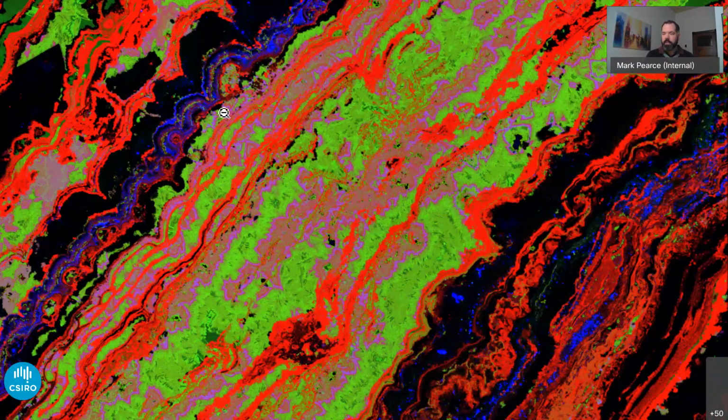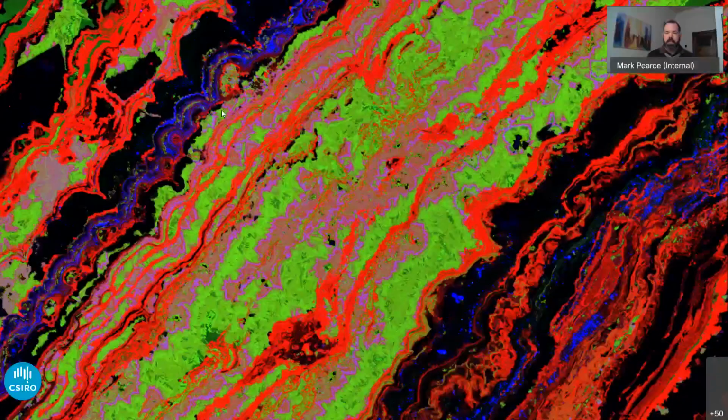And the manganese in green is picking out very nicely the vein carbonates. Where we have iron and zinc both hosted within the carbonates, this produces this kind of fuchsia layer. And this is telling us about when the zinc is arriving in the rock relative to when the carbonate grows.